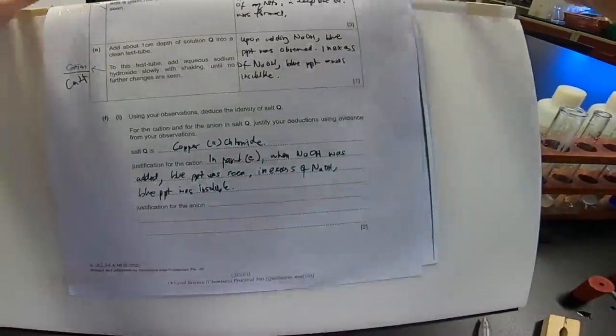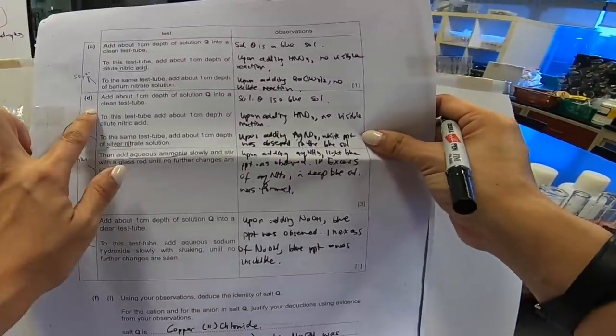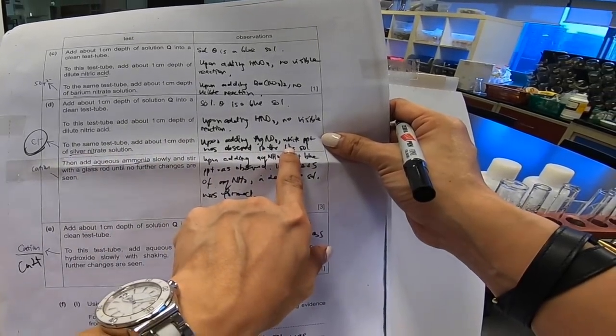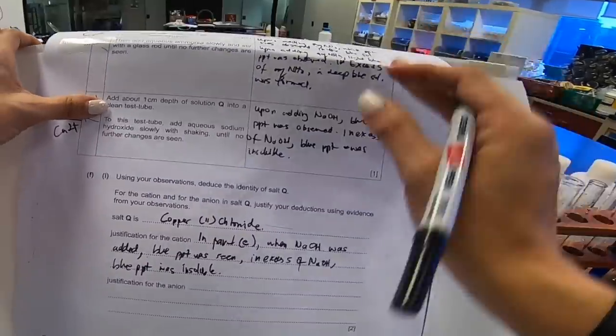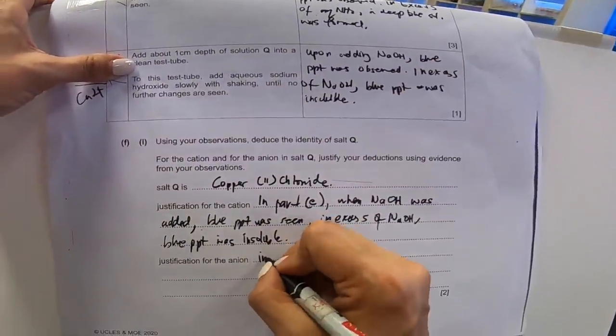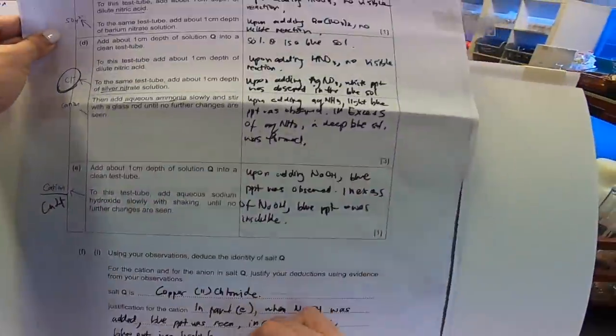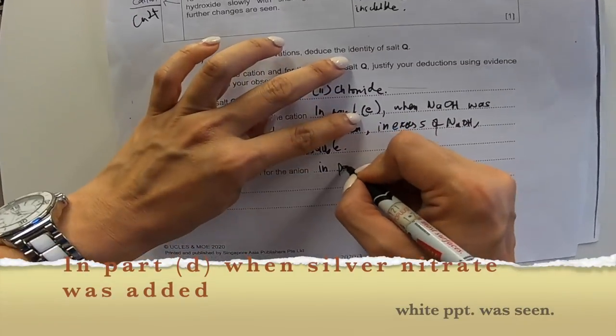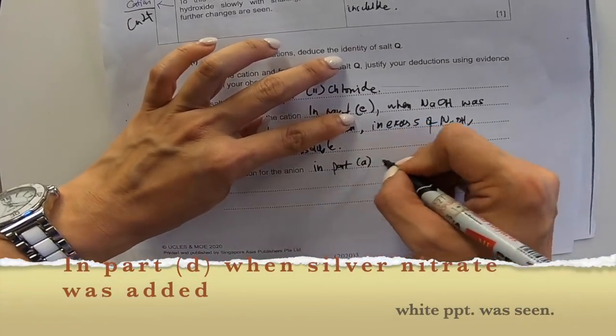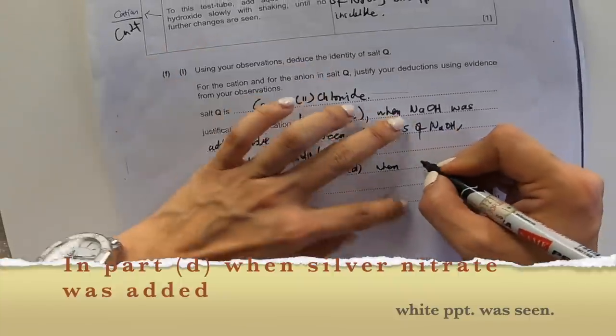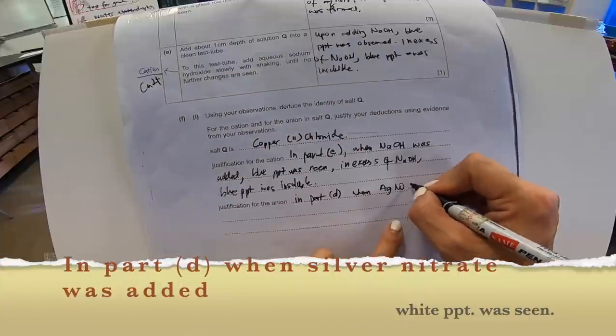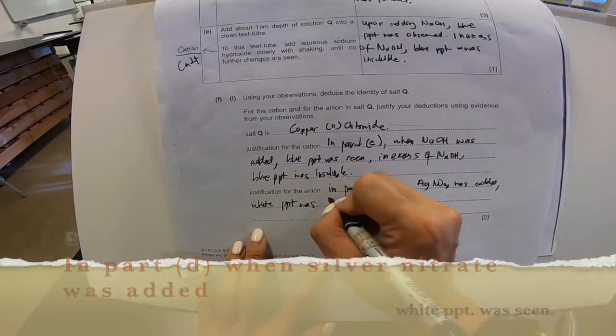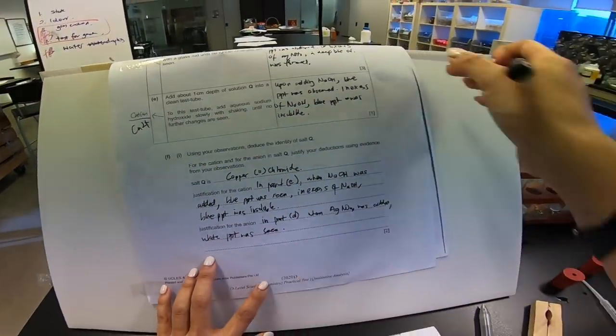Okay, justification for the anion is obvious in part D because I added silver nitrate and a white precipitate was seen. It's part D. So in part D, when AgNO3. Well, we finished this portion. Let's move on to the next part.